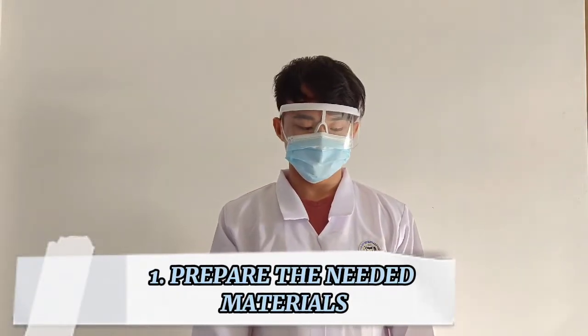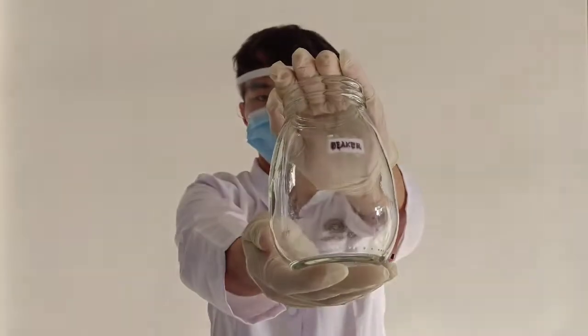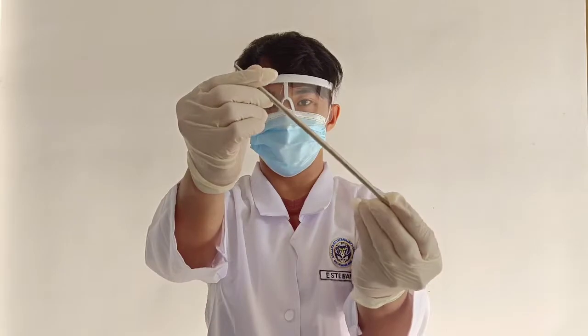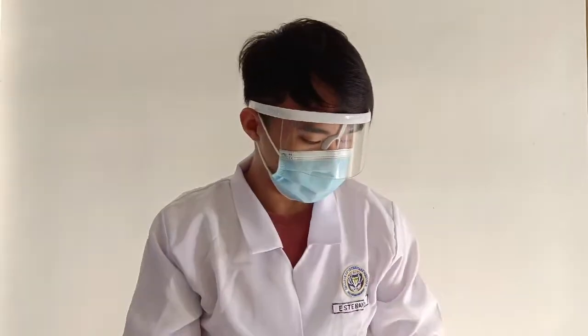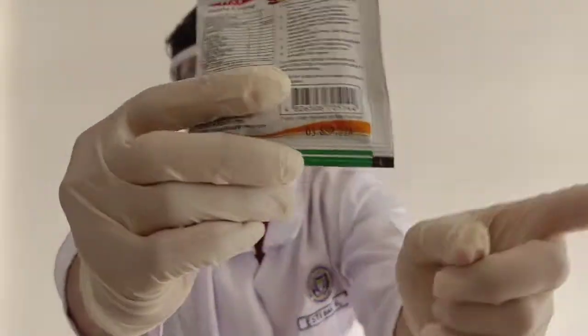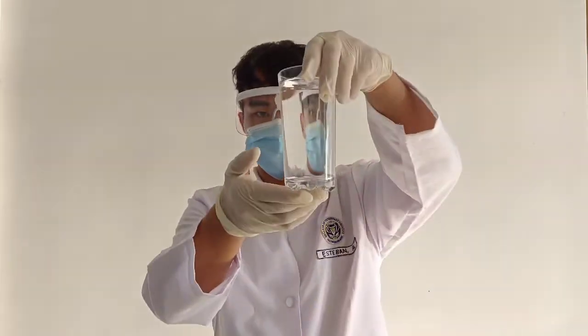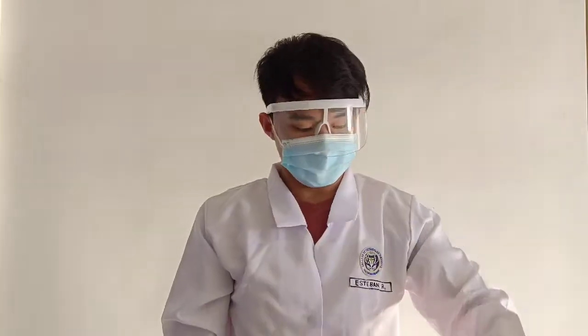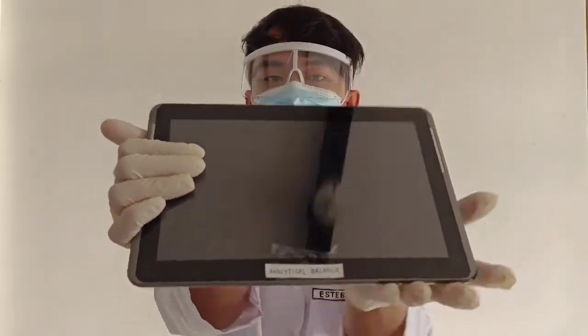Prepare all the needed materials: beaker, stirring rod, test tubes, and our culture media — always check the expiration date. You will also need water, an analytical balance, a hot plate, and an autoclave sterilizer.